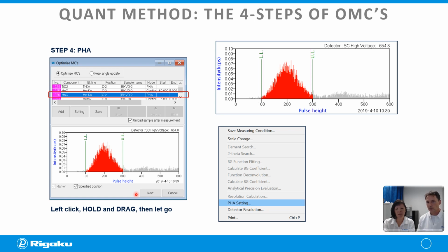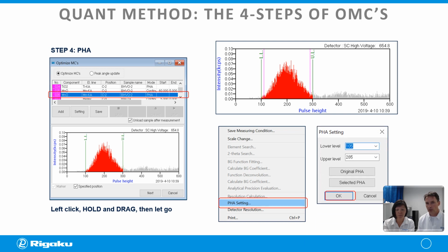So how I relate to this with mass spec, for all those out there in the mass spec world, is it's kind of like you're doing the collision cell energy. You want to just focus in on that narrow window area and then exclude all the endogenous interference with the noise. That's why we're putting these limit ranges, the lower limit and the upper limit, to just focus on that energy window right there. Usually the defaults are really good. This again allows us to go in and optimize as we wish. Right. Okay.